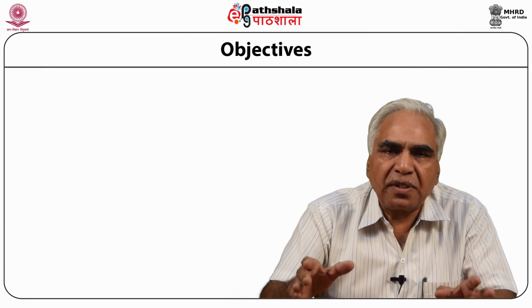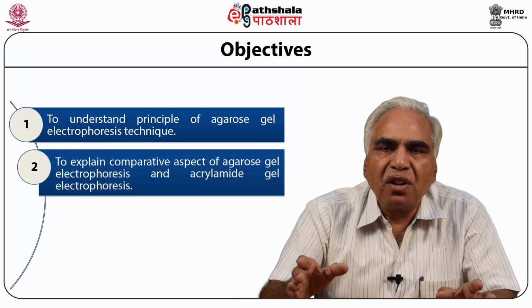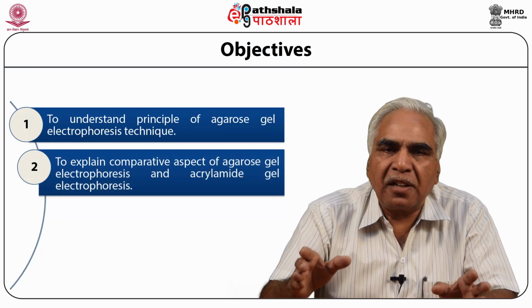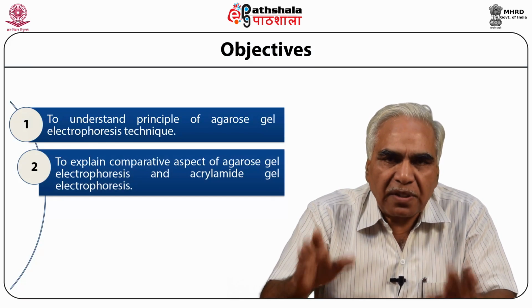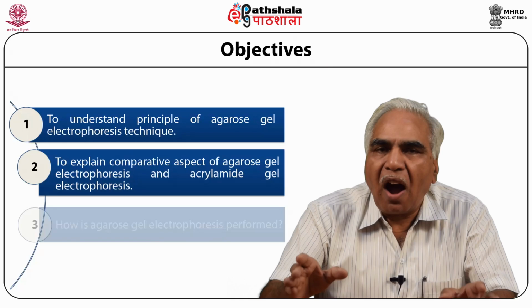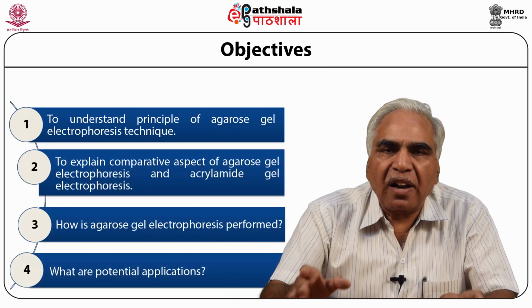Today I will be presenting agarose gel electrophoresis, and the focus will be to make you understand the principle of agarose gel electrophoresis. You will also be given a comparative aspect of sodium dodecyl sulfate polyacrylamide gel electrophoresis vis-a-vis agarose gel electrophoresis. The presentation will also cover how to perform agarose gel electrophoresis. I will also be explaining the applications of agarose gel electrophoresis.